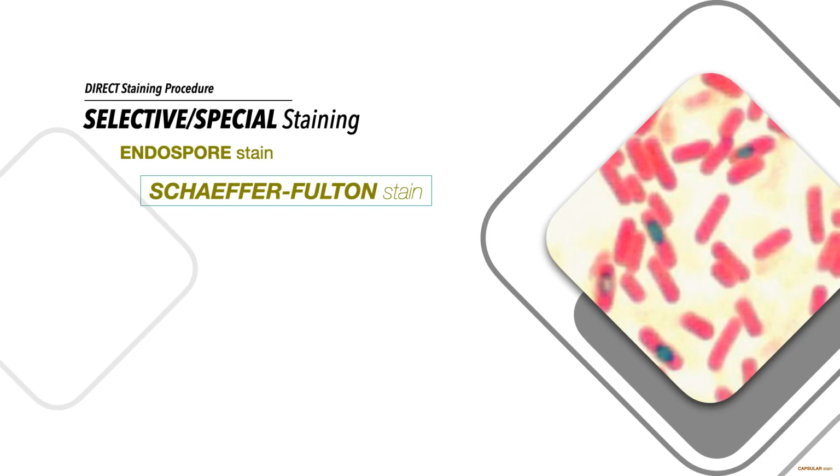And again, your endospore, being very tough, is not easily colorized, guys. It doesn't easily pick up stain, and if it does get stained, it's also not easily decolorized. Because of the presence of dipicolinic acid, calcium, and peptidoglycan complex, it is also further coated with a keratin layer. That makes it extremely impenetrable. So further about that, let's move on with the procedure.